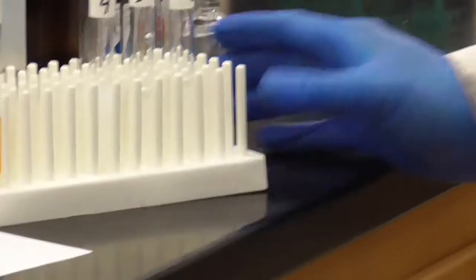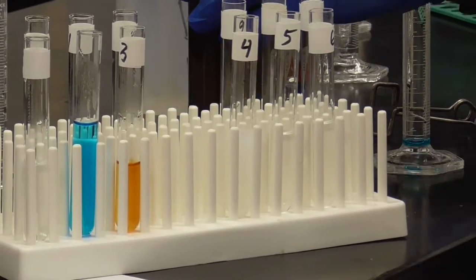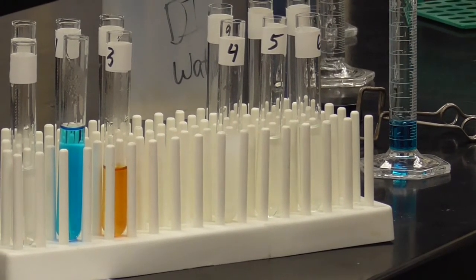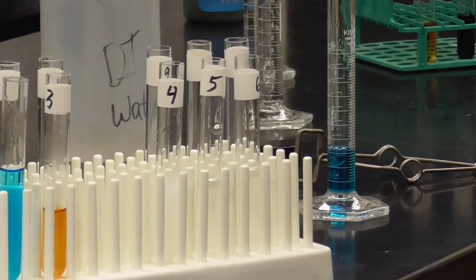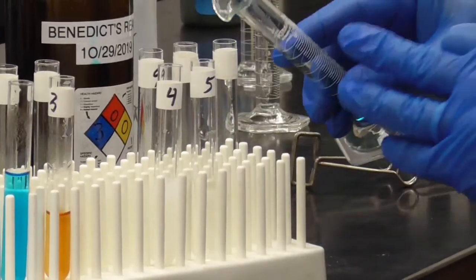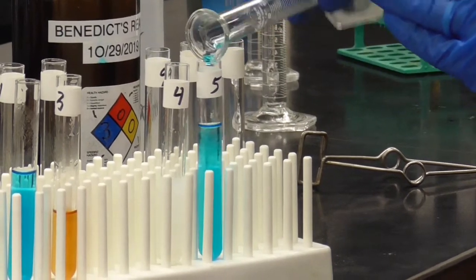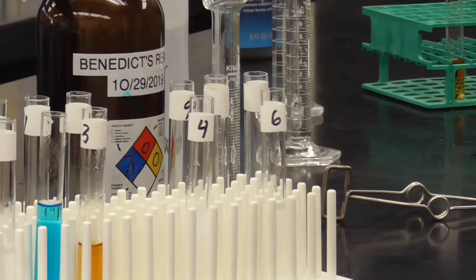All right, let's try the second test. The one for glucose. Has glucose been crossing it? So we'll do tube 5 for that. Again, we add 3 milliliters of our Benedict's reagent, and then we will heat it up for 3 to 5 minutes. So we'll get my 3 milliliters. There we are. Pour that into test tube number 5. This one out of the way. Okay, and do a quick mix, and we'll go ahead and put that into our boiling water bath here.